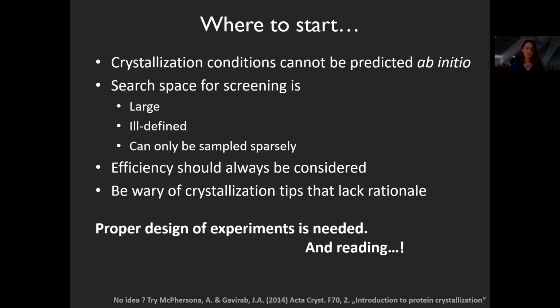The search space for screening is of course large. You can change the temperature, the pH, every chemical that you add, its concentration, the method of crystallization. You've got seemingly endless possibilities. It is also a very ill-defined search space because you don't know, should I stop at pH 4 or should I go to 3? And it can only be sampled sparsely because you and no one else wants to set up 10,000 different drops. People do this from time to time, but you will later see it's pretty unwise given the statistics.